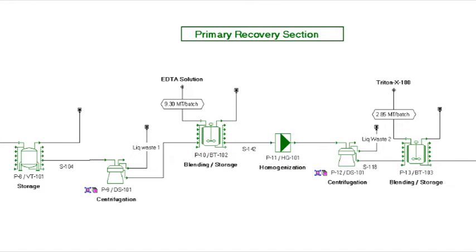Operation Unit 12: Centrifugation DS101. The same centrifuges as before are then used for inclusion body recovery.